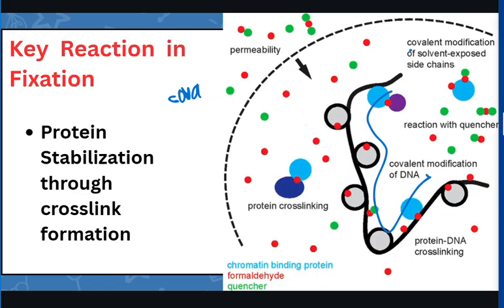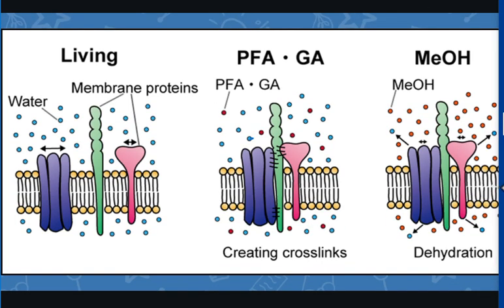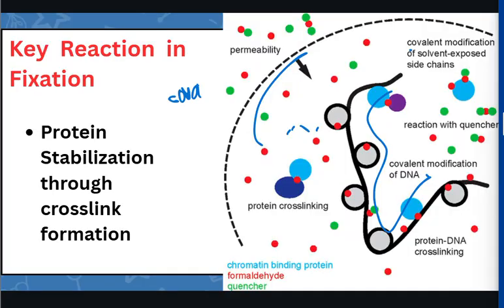So this preserves the 3D molecular arrangement of the tissue, it locks the interactions, and it maintains the structural integrity of the sample.